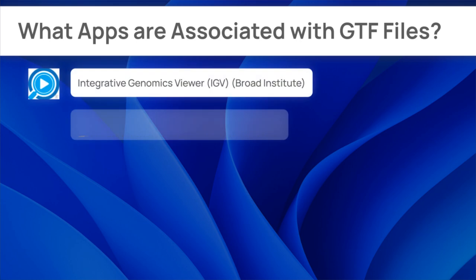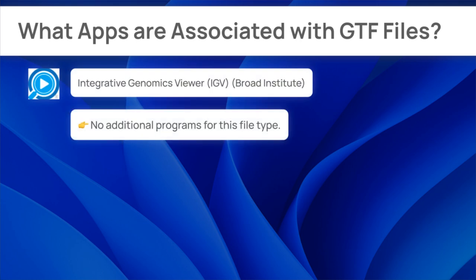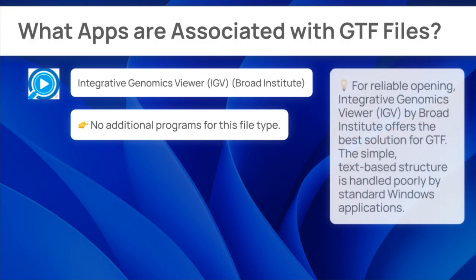The primary software for GTF is recognized as Integrative Genomics Viewer, IGV, developed by Broad Institute. The simple text-based structure is handled poorly by standard Windows applications. Windows can't decode structured data fully, so compatible tools are needed for comprehension.